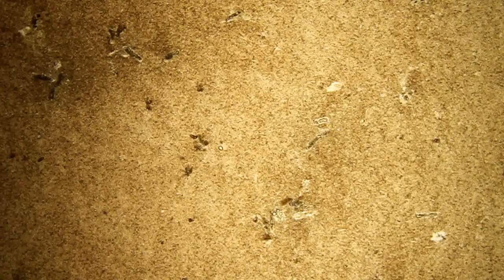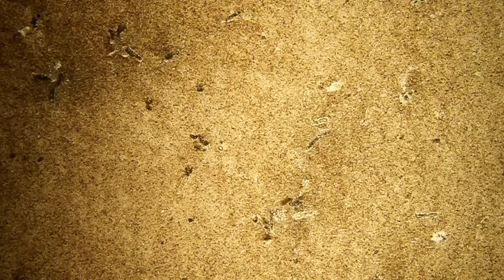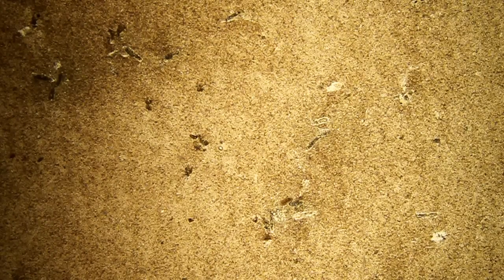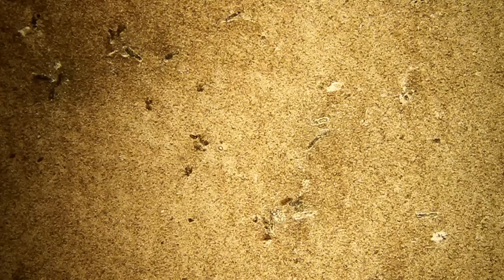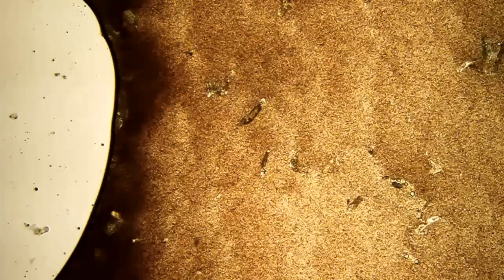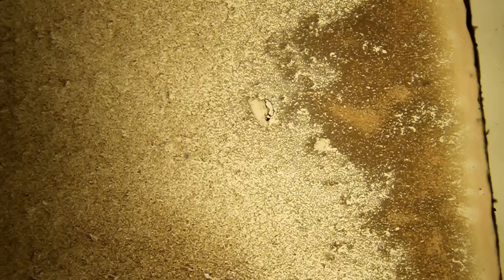Adjusting the condenser, there's a hot spot in the middle that I didn't notice. Hard to focus on this little stuff. Get over to the edge of the cover slip here. This is probably dried up quite a bit here.